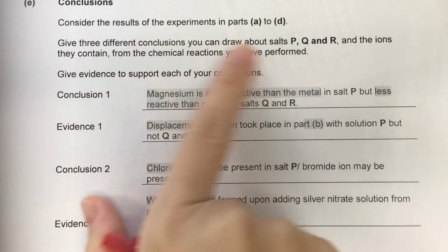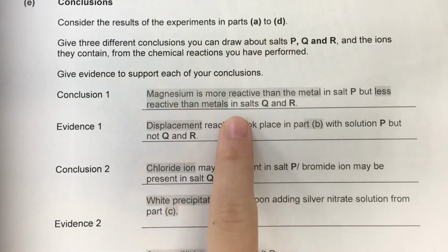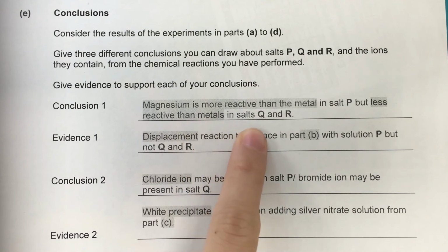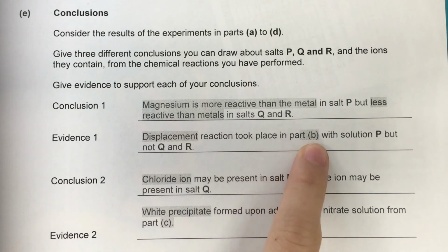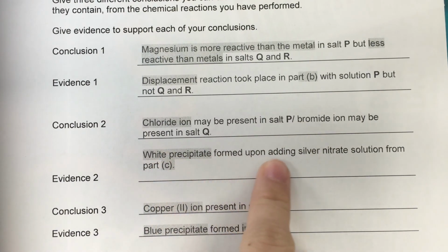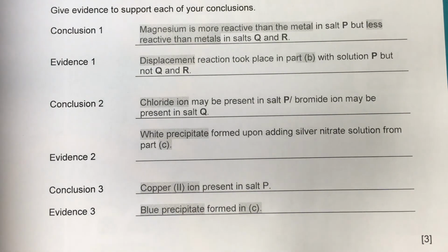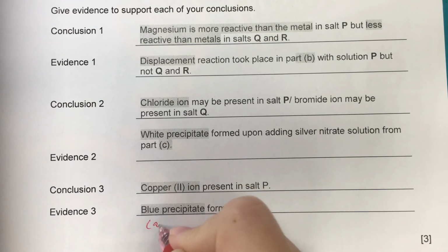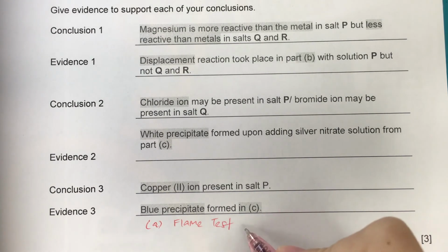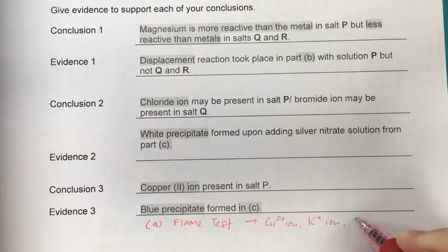Okay, so finally, for our conclusions, it says look at part A to D, draw conclusions about salts P, Q, R and the ions they contain. Based on the displacement reaction, we could conclude about the reactivity, or we can conclude even about copper ion being in this test. The next conclusion can be about chloride ion, because white PPT was formed for part C. Conclusion 3, because of the cation test, which is very clear, copper 2 ion is present. Other conclusions that were not written here could be from the flame test, which is part A, where you can conclude the different cations. Okay, we cannot say anything about sulfate ion because sulfate ion is absent. They're asking you for what ion is present.